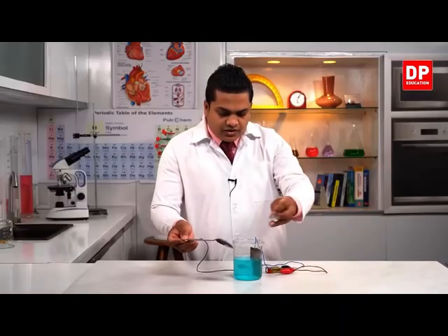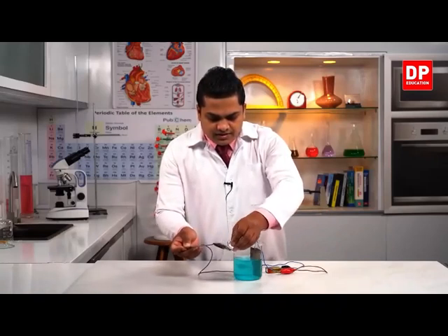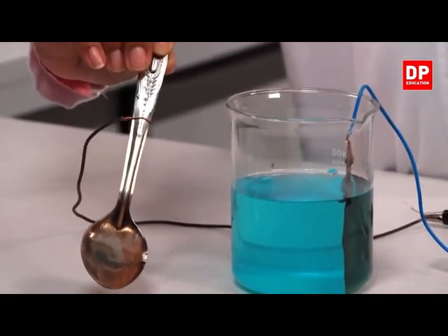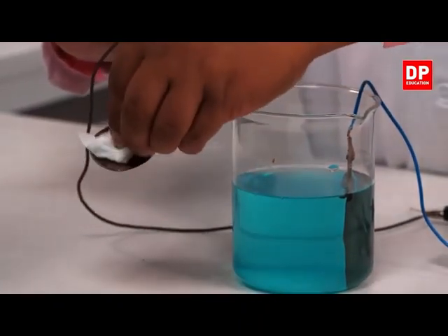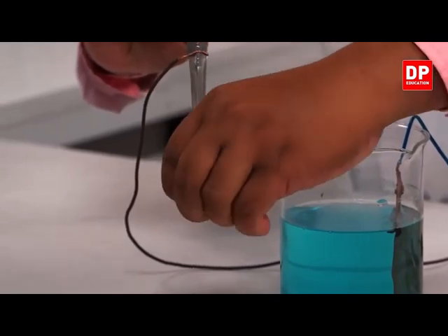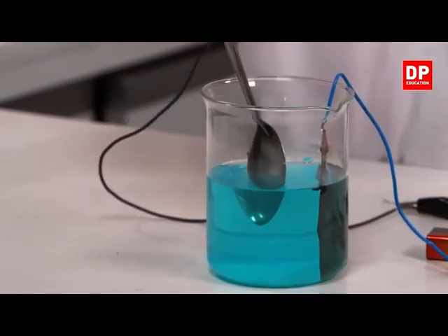Once again, let's remove the stain like this. And once again, I'm going to show it to you. So here you can observe it very clearly. See? So let's wipe it off. So I have wiped it off. Let's insert it once again.